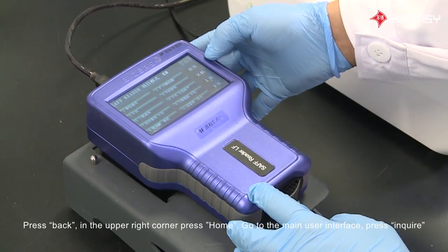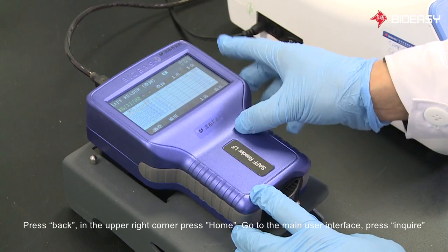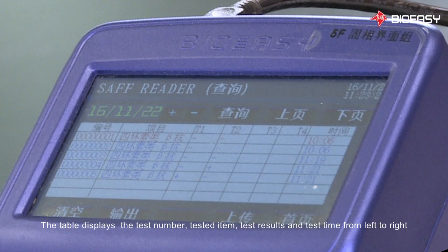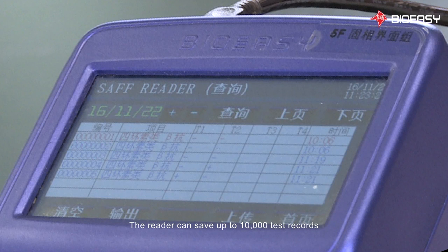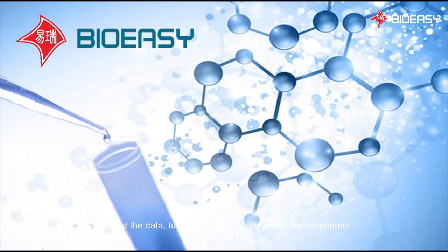Press Back in the upper right corner, then press Home to go to the main user interface. Press Inquire. On this page, you will find the test history. The table displays the test number, tested item, test results, and test time from left to right. The reader can save up to 10,000 test records. Record the data, then turn off the reader to finish the experiment.